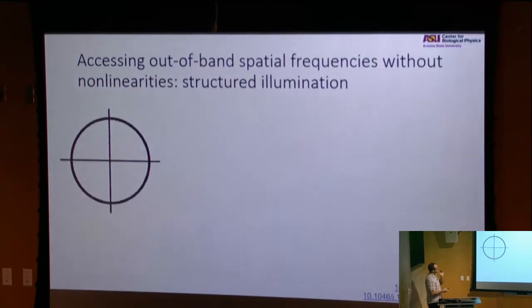And so what we really got focused on about 2 years ago was this method called structured illumination, which is a question of how do we access out-of-band spatial frequency information without the nonlinearity? I'm going to walk you through how this method works. Here we have the 2D representation of the optical transfer function. I guess the kx and ky got lost here.